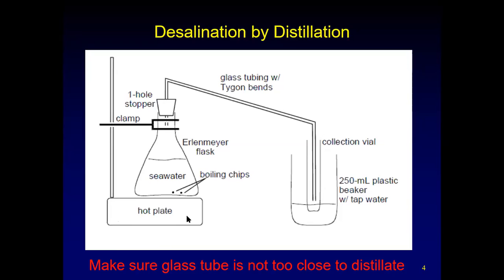And what we would be doing in this lab is basically desalinization. So we would have taken, I believe it was water from Ocean Beach, seawater samples. You would have put it in this distillation. You'll see this in the video. And then you'll put boiling chips on, and you have this tubing with a rubber stopper.